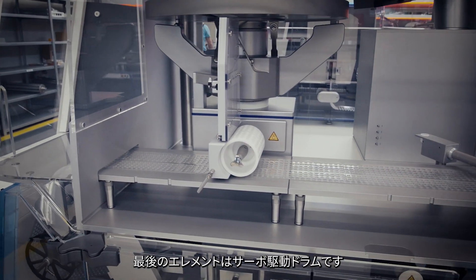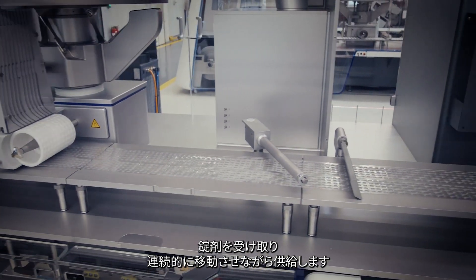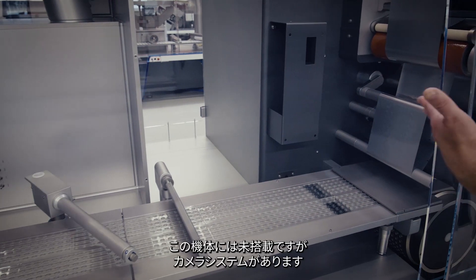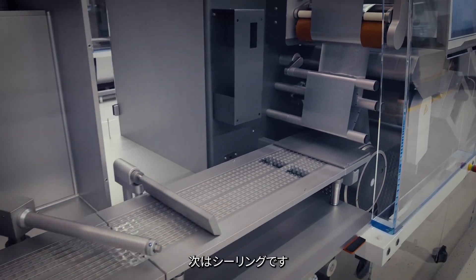The last element is the servo-driven drum which receives the tablets and presents them in this continuously traveling web. Following items are a web cleaning brush, a product height detection, and certainly a camera system — not yet installed on this machine. The sealing is next.